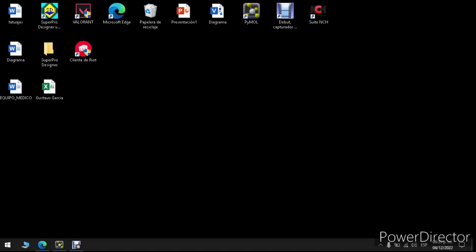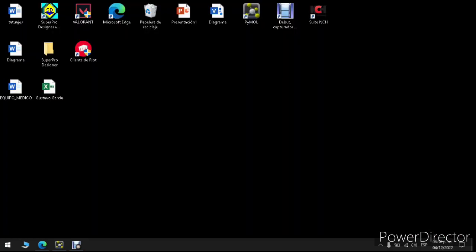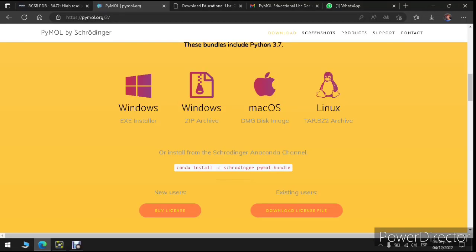Well, as a continuation of this part of the video, I'm going to talk about how to use PyMol. But it's important to say that before you can use PyMol, it's a free software that you can get on the official page. You can buy a license, and you can have a free license just for students.